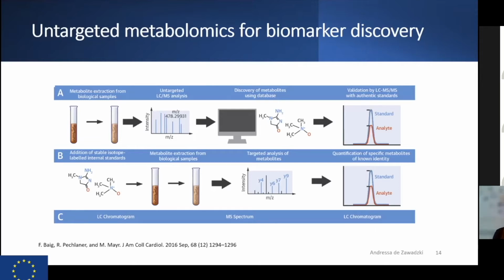On the other hand, when you already know in advance that a specific disease will affect specific metabolite pathways, and you can then look specifically, monitor exclusively those metabolites that you know are affected, with a lot of details in a way that you are able to also quantify these changes in metabolite profiles, then we say that we have targeted analysis. To do targeted analysis, you really have to close your window of investigation and focus on a specific class of compounds or a specific panel of compounds.